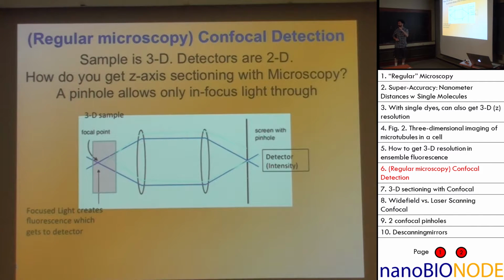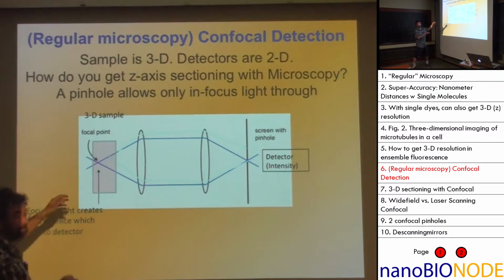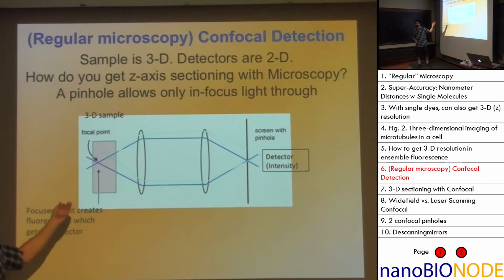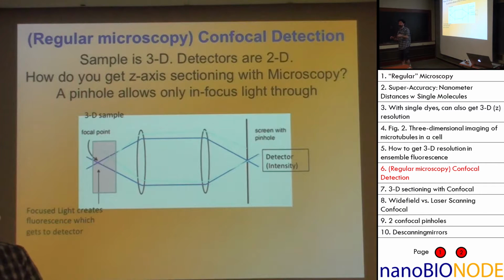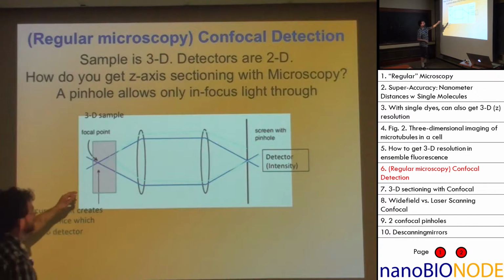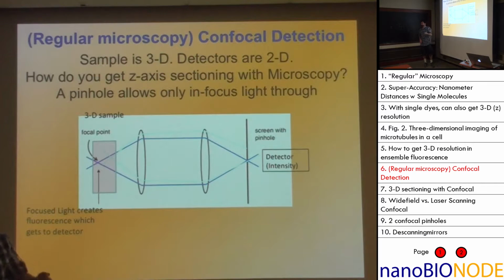And so, okay, we've gone too far. So then we want to open it up a little bit. Maybe we see enough photons, so we're happy. Maybe we're not. Maybe we need to open up a little bit more. And that is basically the situation. You have to decide, are you photon starved or are you limited by your Z resolution?